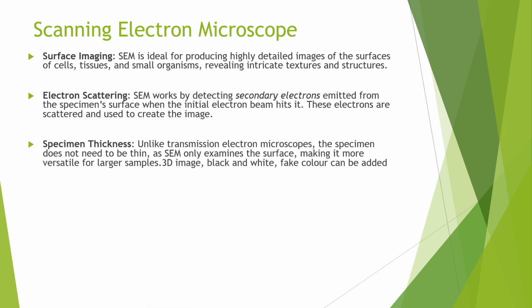One of the major advantages of the SEM is that the specimen does not need to be thin, unlike with the transmission electron microscope. Since SEMs only examine the surface of the specimen, it can handle thicker samples, giving it a broader range of uses.